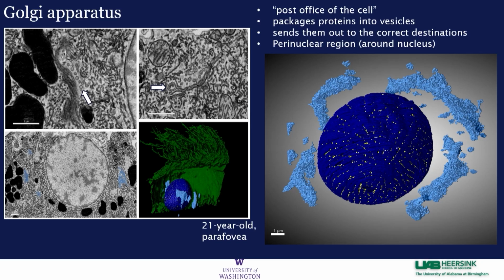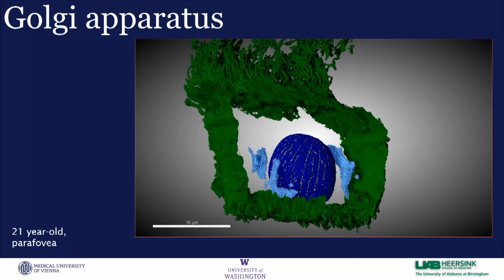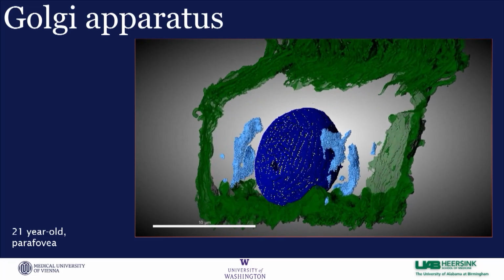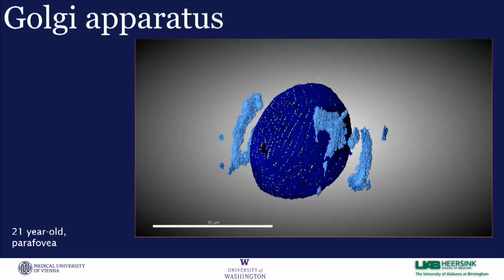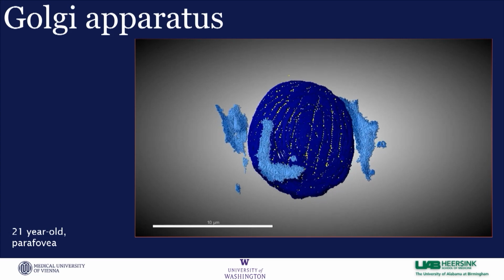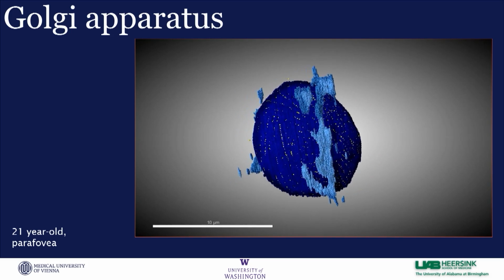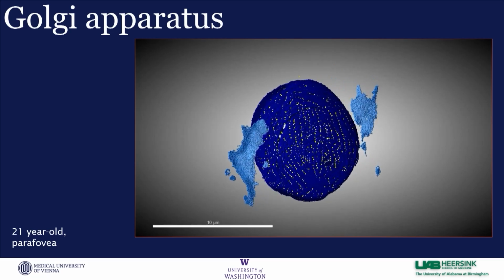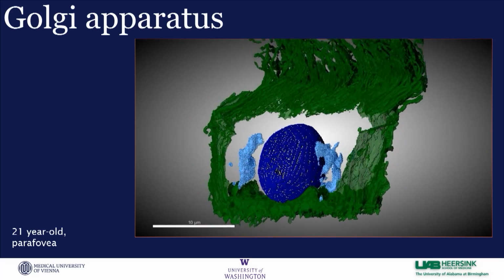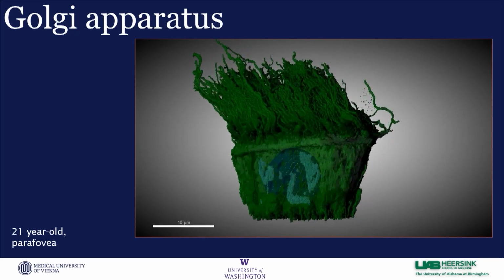And we made a short video showing just our cell with the Golgi apparatus in light blue, and the nucleus inside of the cell body, kind of cropped. I think these are all meshes, and this is all made in the Dragonfly Movie Maker. So again, pushing the limits of our hardware. There are a few little glitches like that. I don't think it's supposed to happen, but overall, we were quite impressed with the potential for this segmentation and for these architectures and deep learning.